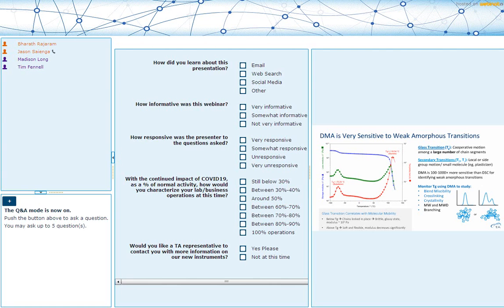How is this glass transition being measured? Is it being reported based on a tan delta peak, or the storage modulus onset point? What is the temperature ramp rate, and what is the frequency at which this is being tested? All these three things have to be reported to allow some sort of comparison across one site and the next. And again, there is no correct answer. Again, we tend to report it in terms of tan delta.